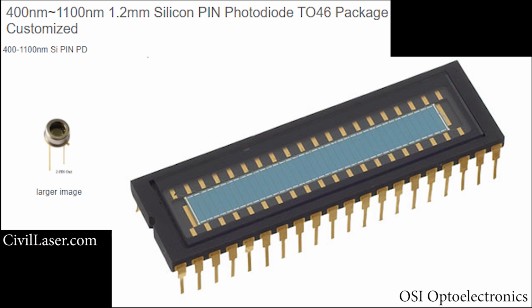But this is actually cheaper than a scanning instrument, even though you have all these photodiodes. And photomultiplier tubes are awesome, but you're not going to take an array of 2,000 of them and put them together. So these are inferior detectors to photomultiplier tubes, except they're awesome because you can make this giant array of them, and you can have all the light hit them all at once.